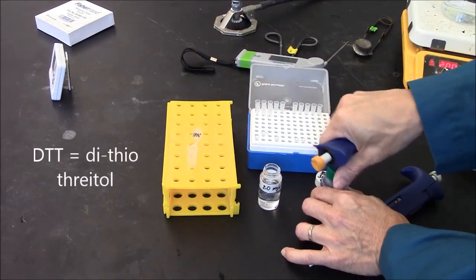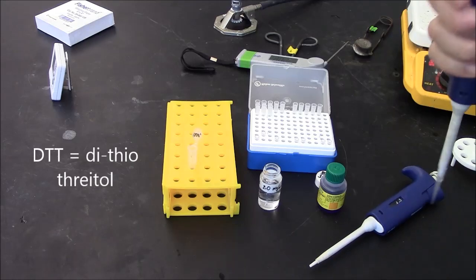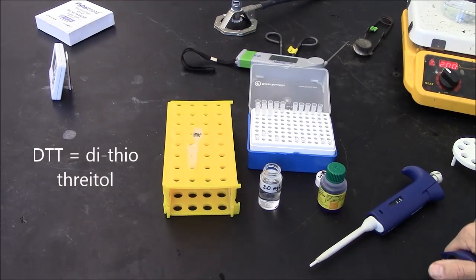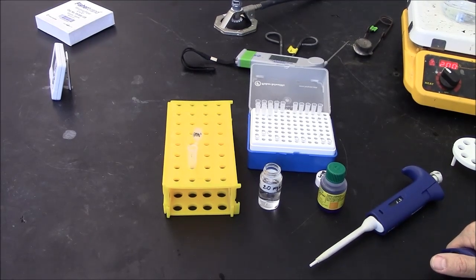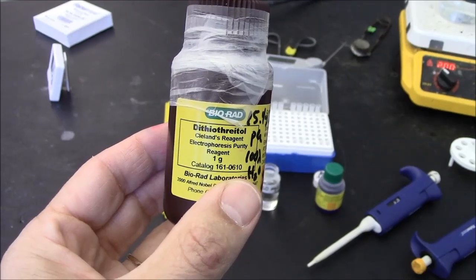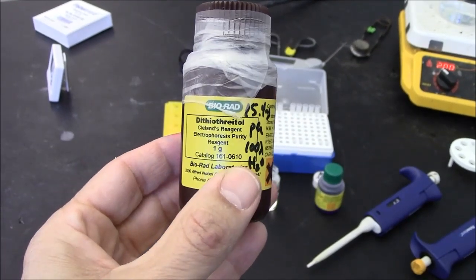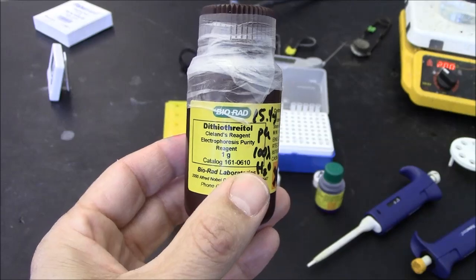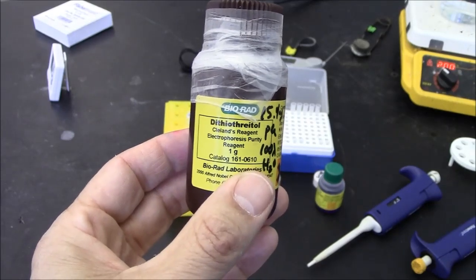Now I need to add some Dithio-3-etol to break the disulfide bonds in the protein to reduce it. Dithio-3-etol is a sulfur-containing molecule that is excellent at breaking disulfide bonds in proteins.